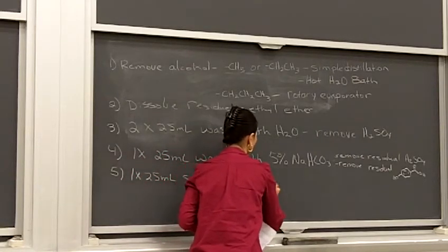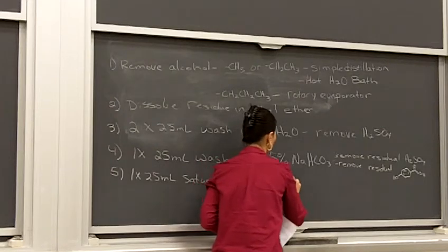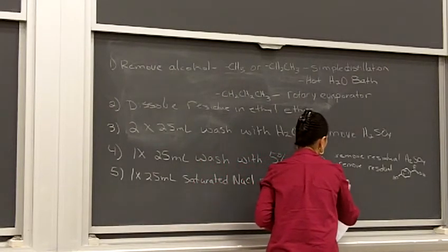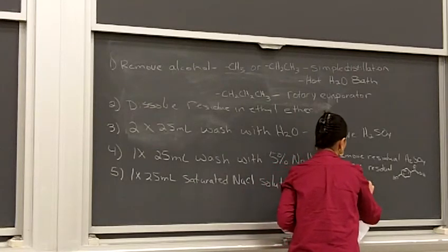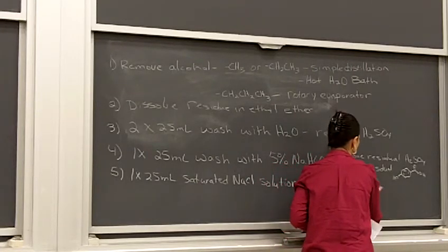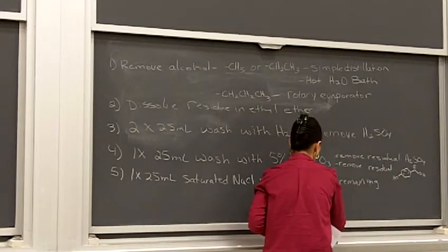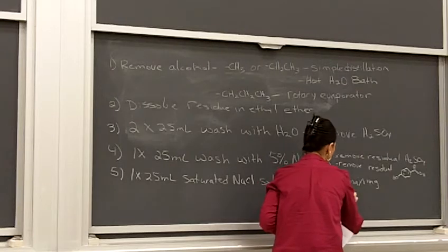With saturated sodium chloride solution. This helps remove remaining salts and a little bit of the water out of the ether.